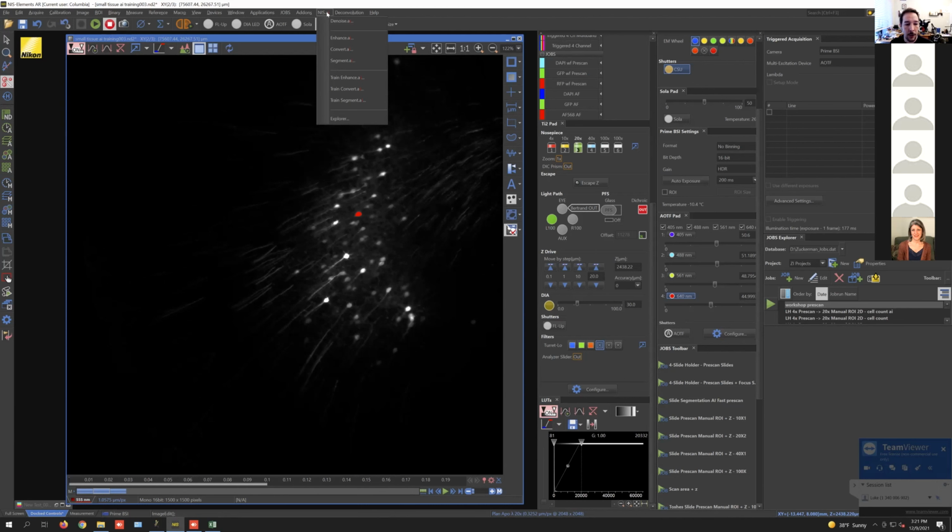The network that we have trained for working on tissue sections is robust across many different labels, and at least for the cell bodies in neurons, if they're virally labeled neurons, it will work quite well. But obviously your mileage will vary, so I would always check to see what output I'm getting.